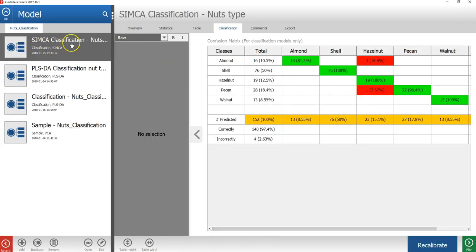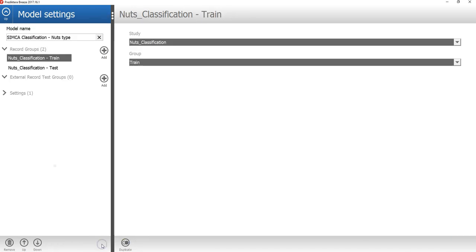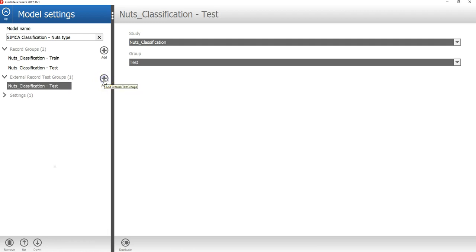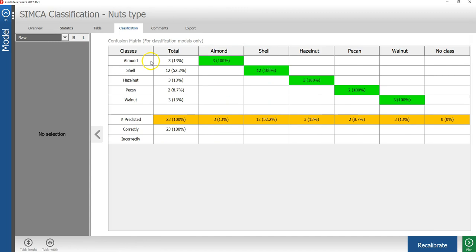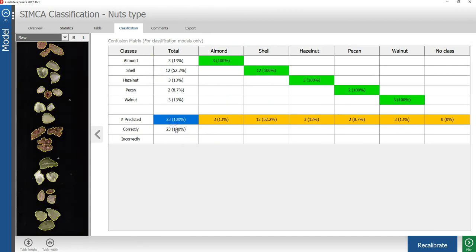Then when the Simca model is selected, I will click on the edit button down here. Then under external record test group, I will press the plus sign to add this test group. I will then go up again here, back to the classification table. We can see here that of the 23 samples, all were correctly classified.